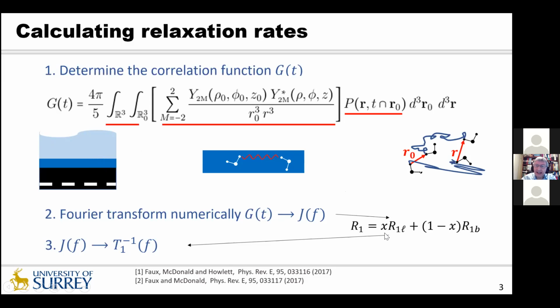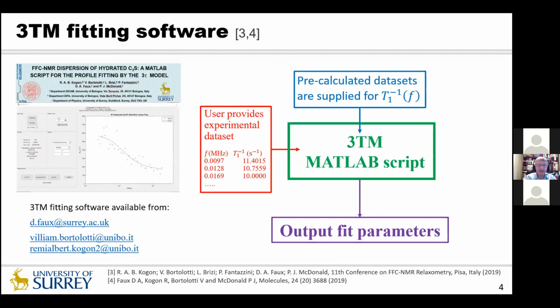This quantity X is one of our fit parameters. It comprises the fraction of the water in the layer of the pores. Okay, that looks really scary, but don't worry, you don't have to do any of these calculations. We have done them for you.